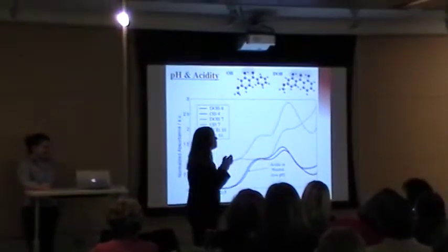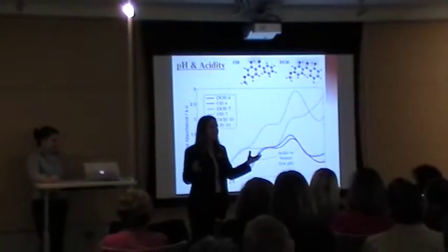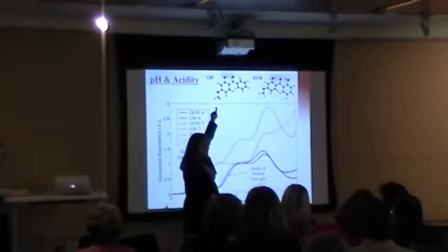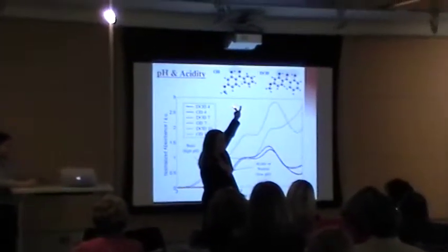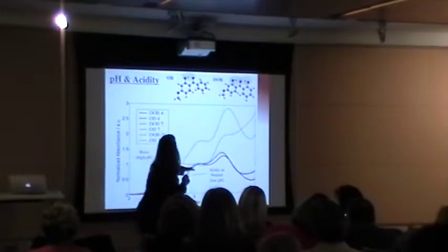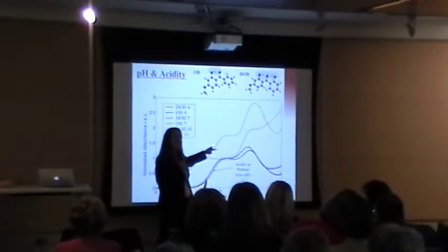So to probe if there's an acidic character to this molecule, what you can do is put it in an acidic environment versus a basic environment and look, does it care what the pH is? And we see if they're in acidic or neutral environments, those types of environments will have that hydrogen on it. They look the same almost. That's these two lines here, and that's those two compounds. If we put it in a basic environment, what should happen is the acid should release its proton. And we see it shift in the spectrum telling us something happened. But how these two look, not the same. So how they respond is different.